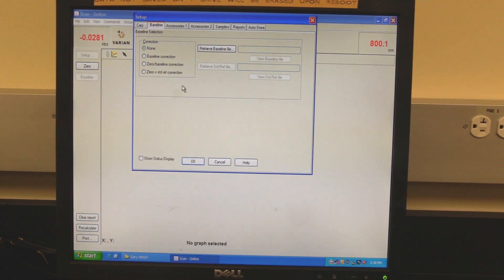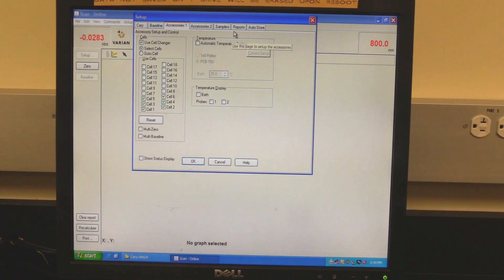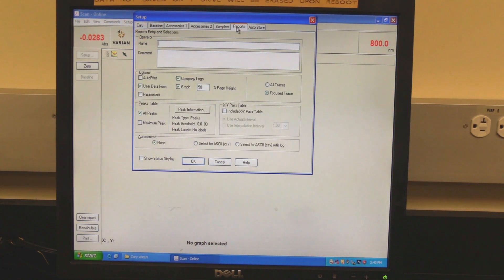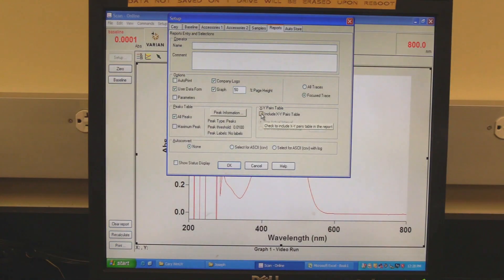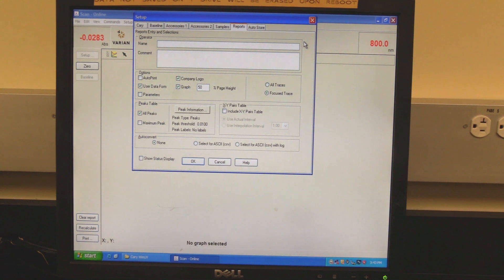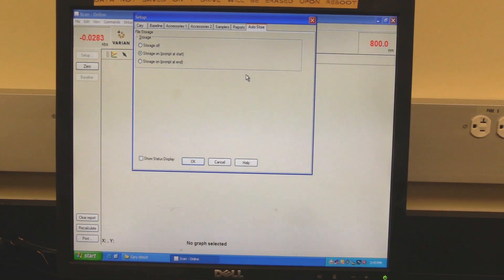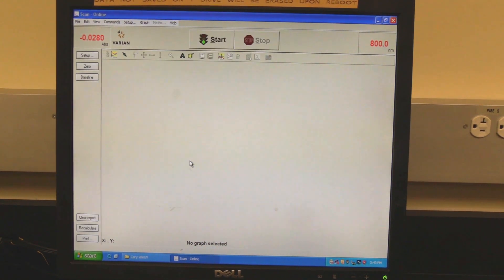Click on the baseline tab. To automatically subtract the baseline, select baseline correction. Click on the reports tab. In XY pairs, check the Include XY pairs table box to include a table of XY values in the report. Click on the auto store tab, select when the software should prompt for the data to be saved. Click OK to set the setup parameters.